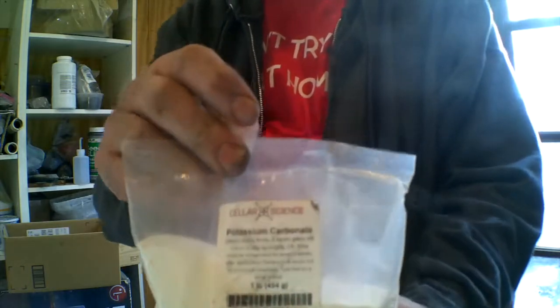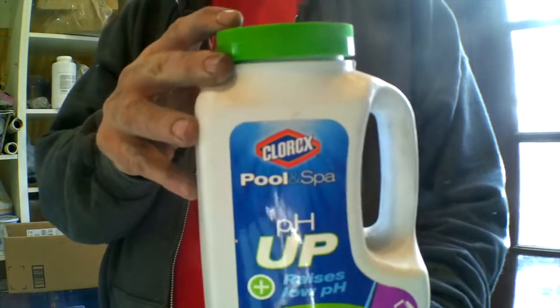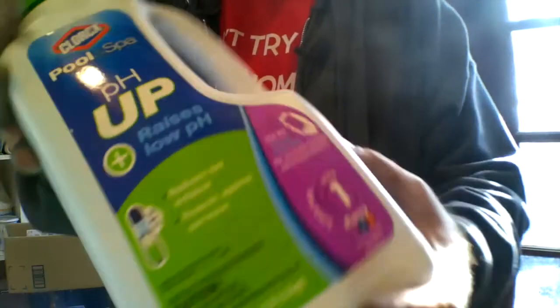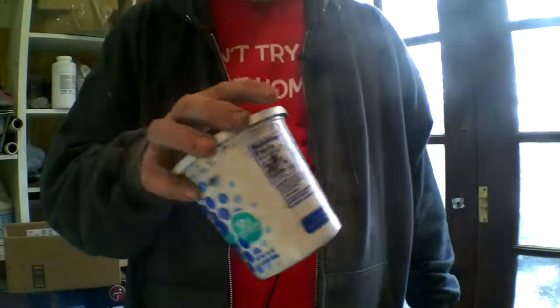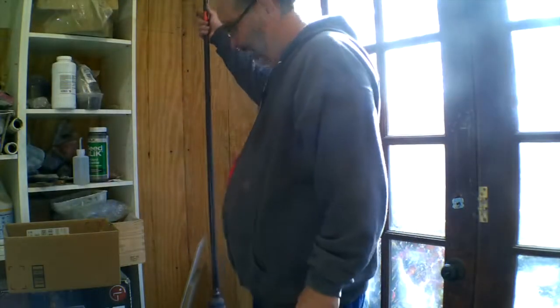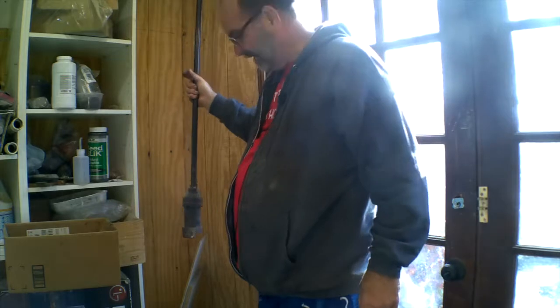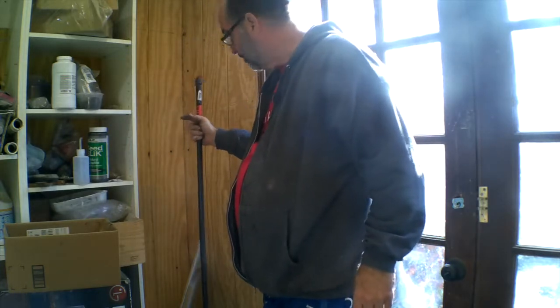Pure potassium carbonate. Pure sodium carbonate. Right there. I got me some powdered charcoal, and what I'm going to do, see if I can get this in view. I've got my vessel there with a nice long pipe on it.